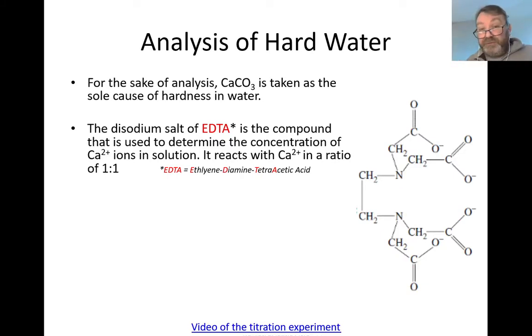They could simply ask you a question, probably question 4, one of the short questions. What does EDTA stand for? Answer: ethylene diamine tetraacetic acid. So please, please, please learn what the letters EDTA stand for. It's a solution which you put into your burette at a certain concentration. You put your water into the conical flask with the indicator and a buffer solution, which we'll talk about in a moment, and you titrate as normal.